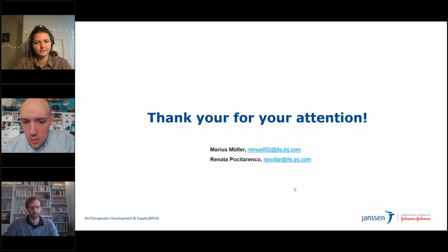Okay, so I will start with this one. What new insights has the FlowVPX provided into your process since your team has incorporated it, either in PD or now?